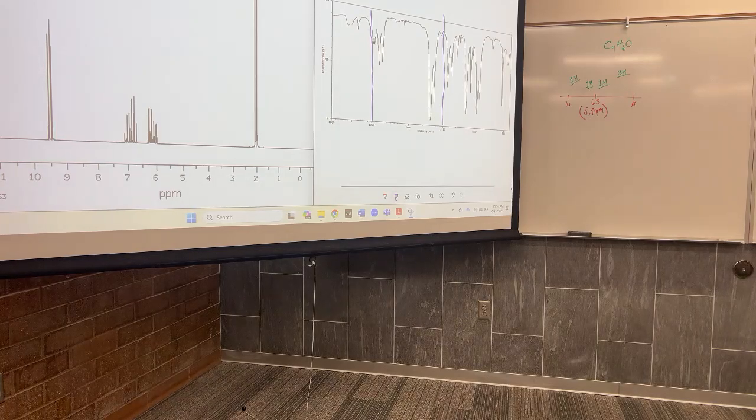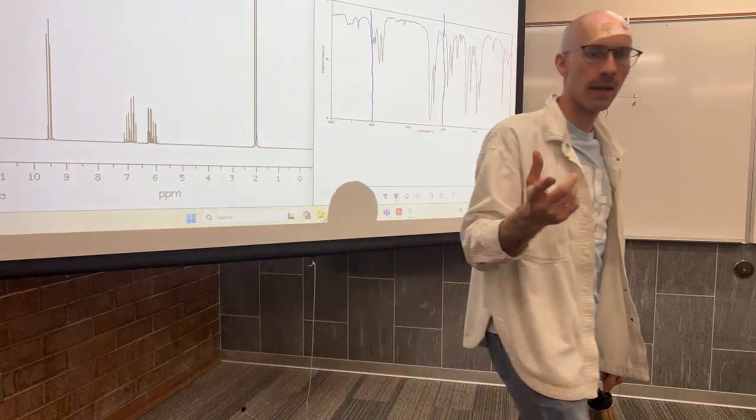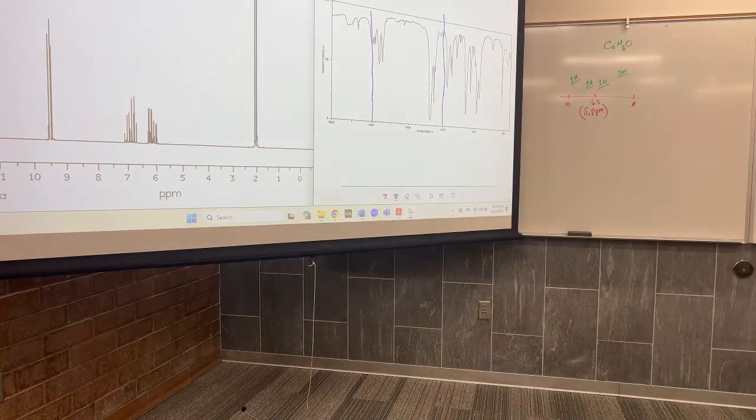And did you do the DOU calculation? Because that will give you some ideas of what you'll have to get in there. I would say that with what you're guessing right now, you're not aware. You're going to find out. 3,000 is where you tell the type of CH. 1,500 is where we don't need to analyze below 1,500 because it just gets a little too in-depth. Cameron, you want to talk with your neighbors and help them get to the same place as you?